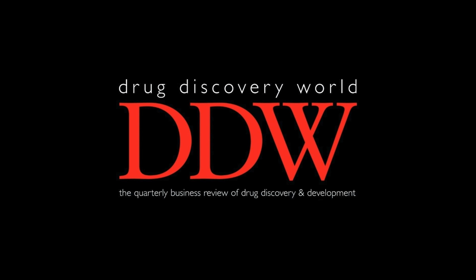development pipeline. In this episode, we look at the addition of long-read data to short-read analysis of RNA, and review several studies conducted using the Iso-Seq method to generate new findings. We will also discuss how long-read sequencing can benefit drug discovery. The Rise of RNA-seq.